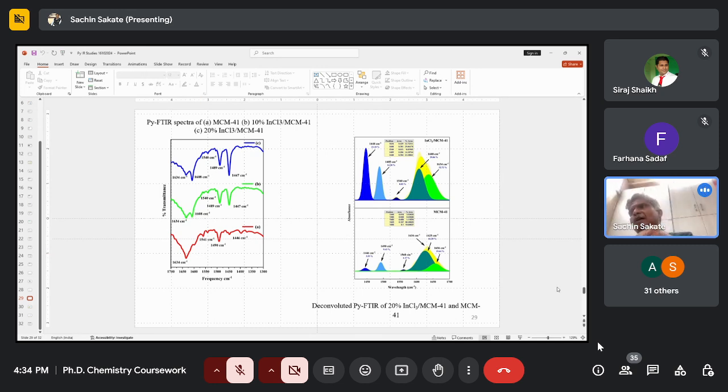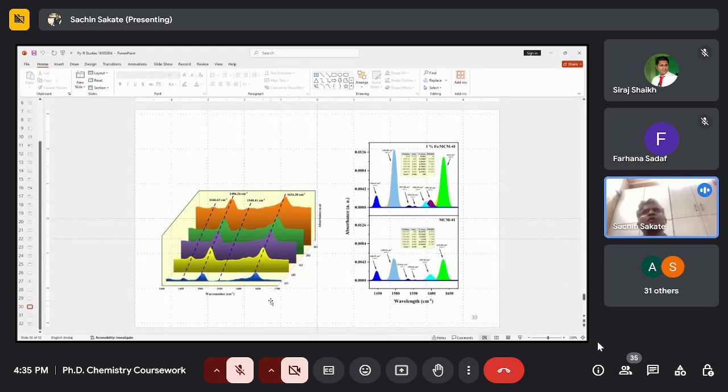You have to go through all these techniques, the minute details of this technique, and you can do a number of analyses also. These are the plots which we have done for FeCl3. Just see that FeCl3 is in different proportions: 1%, 5%, 10%, 20%, 30% we have loaded, and we have quantified the 1% Fe. Remember, 1% Fe is very difficult to handle. That also we have analyzed by using the deconvolution, that is the quantitative measurement of area under the peak.